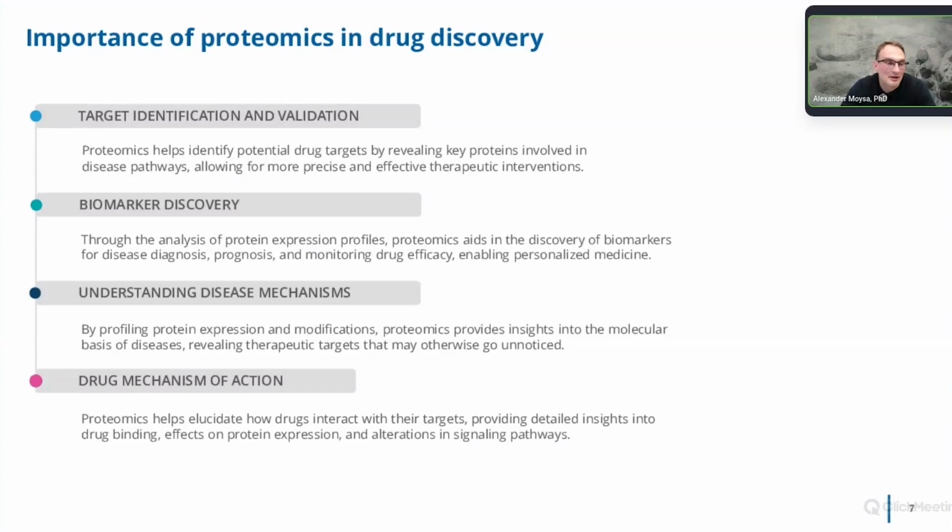Target discovery, target validation, investigation of mechanism of action, off-target analysis, and many other techniques require proteome profiling. These approaches may have different in vivo and in vitro components, but they share a common reliance on mass spectrometry-based protein identification and quantification.